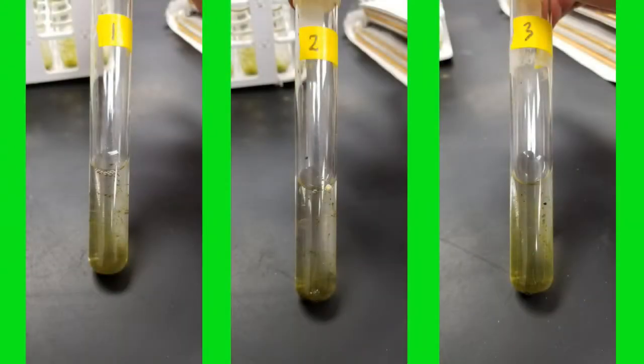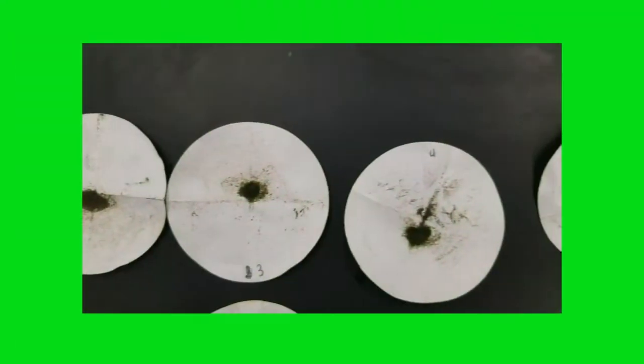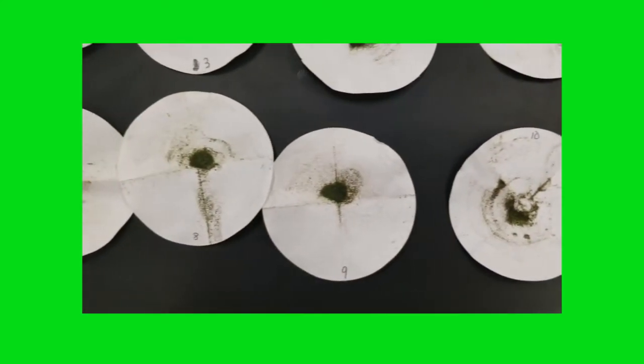On the 17th, we measured the pH, added 3 milliliters of the soil solution to the tubes, and then readjusted the pH on the test tubes to match the pH before adding the solution. Once we finished measuring pH for the experiment, we dried the algae to weigh the amount that had grown in each type of environment. The algae was placed into a dryer at 100 degrees Celsius for 8 hours. Once the time was over, we massed the algae contents of each test tube.